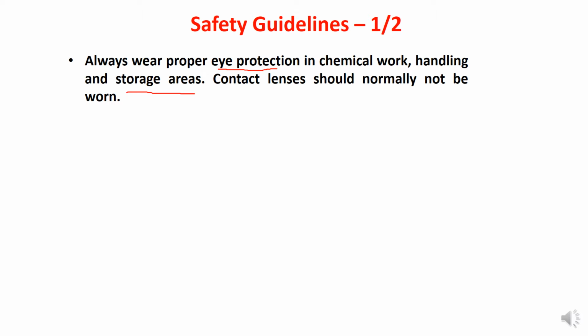Different chemicals are stored there, and they can evaporate into the air, making it a kind of condensed environment. So you have to wear eye protection especially in that area. This is very important.